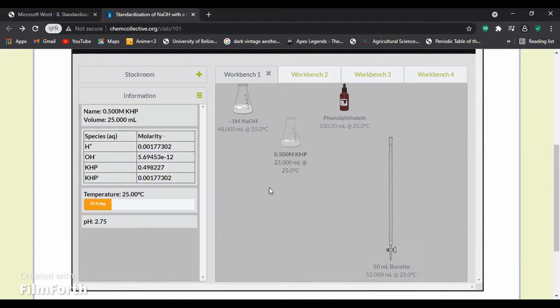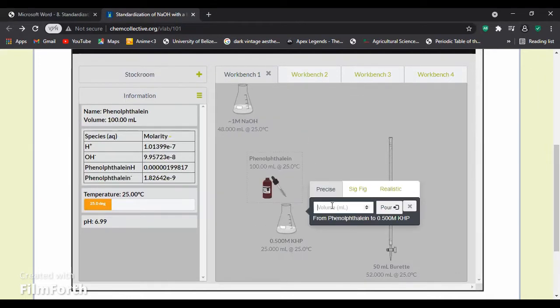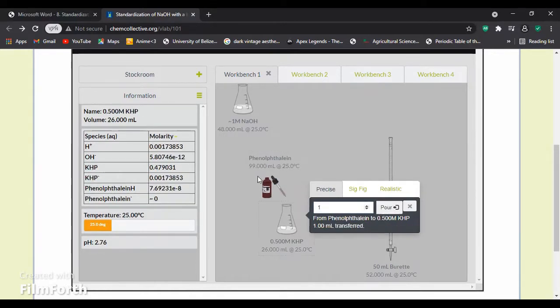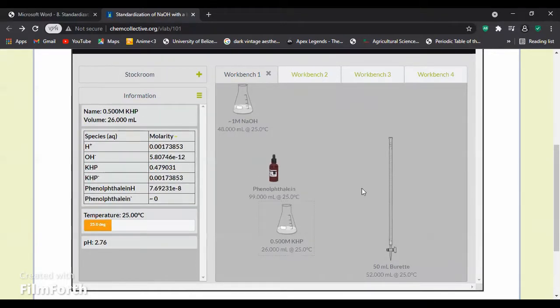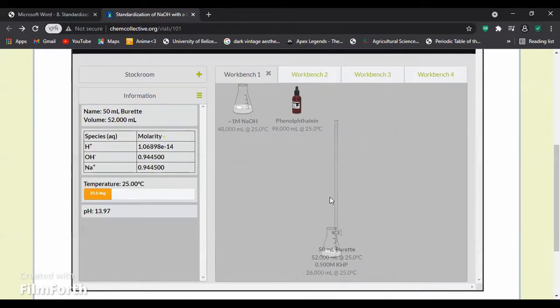We will now proceed with the KHP solution. We will add in one milliliter of the indicator, phenolphthalein, and now we can proceed with the titration.